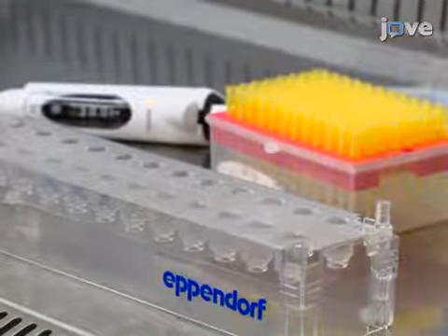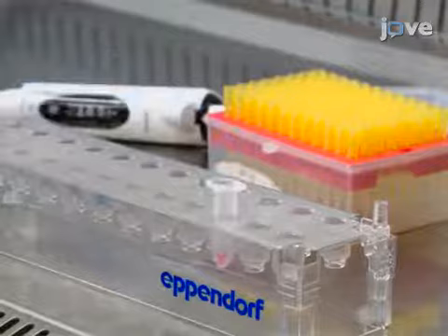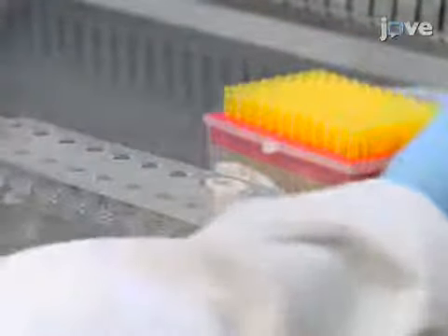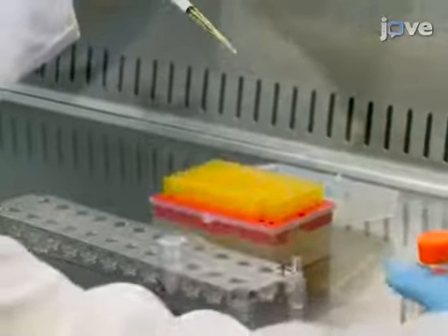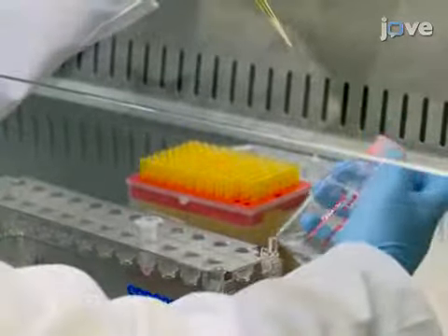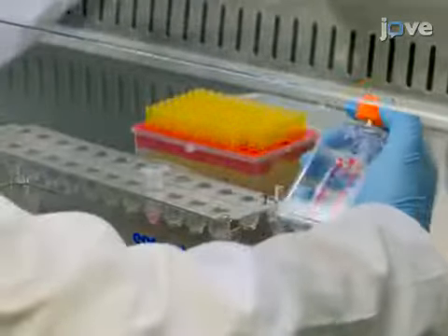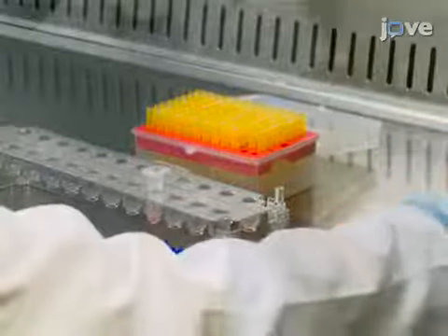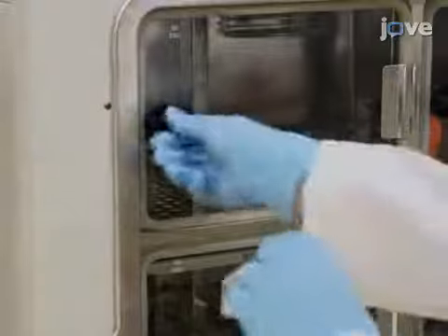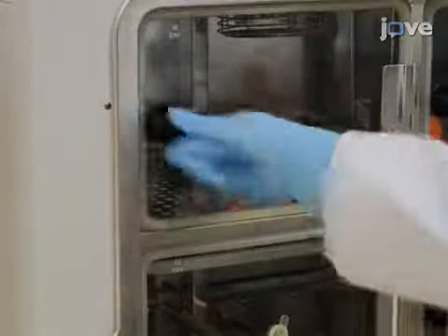After culturing C. burnetii expressing CBU0077 fused to beta-lactamase according to the text protocol, in a 25 cm² culture flask with a vented cap, inoculate 10 milliliters of pre-warmed ACCM2 containing 3 micrograms per milliliter of chloramphenicol with 20 microliters of the bacteria. Grow the culture at 37 degrees Celsius with 5% carbon dioxide and 2.5% oxygen for 7 days.